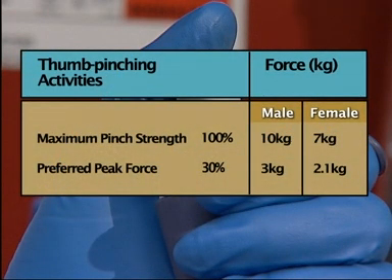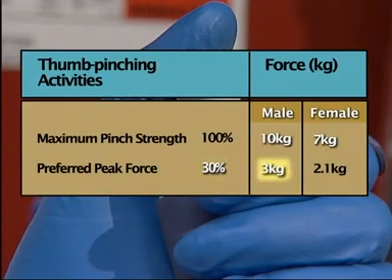Blowout force often exceeds tip ejection force. The lateral pinch strength of females is about 7 kilograms and about 10 for men. Most people cannot work at their peak strength very long without injury. Studies suggest that workers should stay under 30% of their maximum strength level when working for prolonged periods. Newer pipette designs with reduced plunger activation and tip ejection forces make it possible to stay below high risk force levels.